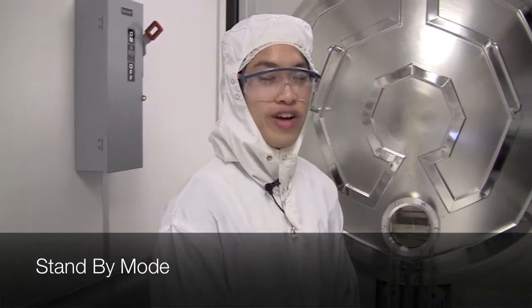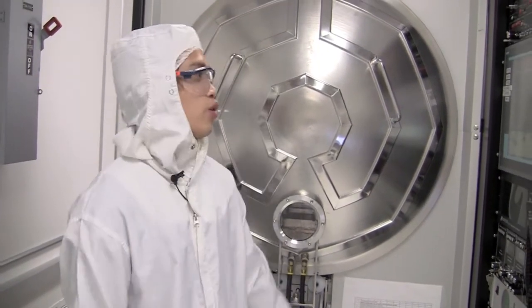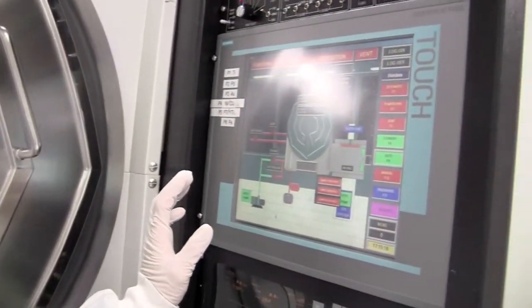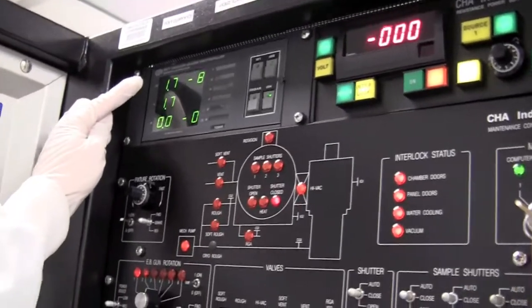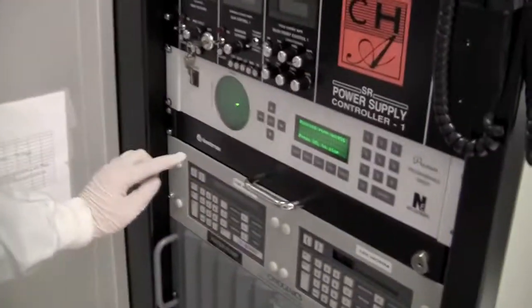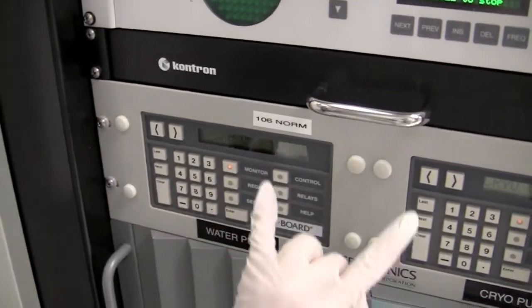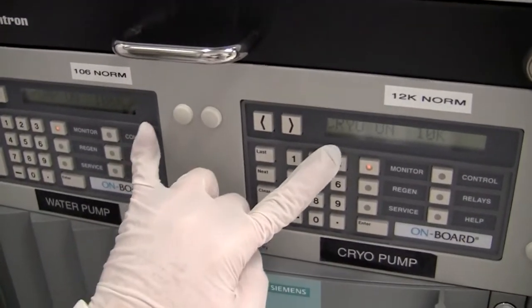Before we use the tool we want to verify that the tool is in standby mode and that no one is currently using the tool. To do this we will first look at the GUI to see that there's no active processing going on. We also want to verify that the pressure is below 10 to the minus 7 and that the cryo and water pump are to spec. We can verify these with the normal temperatures here and the current temperatures here.